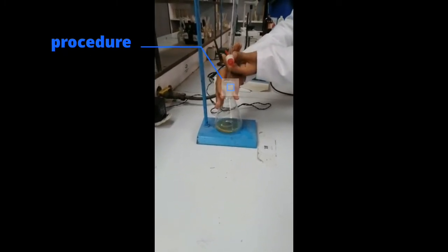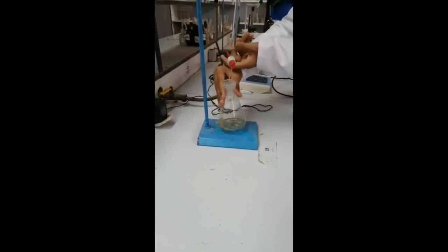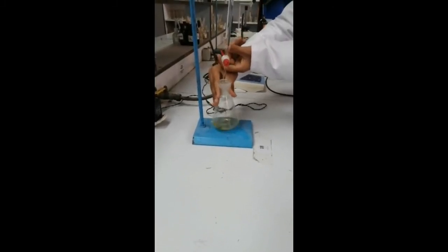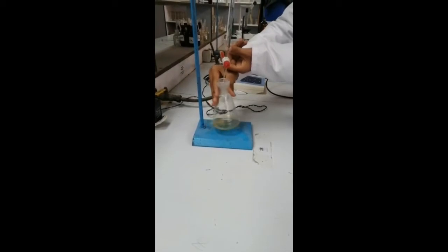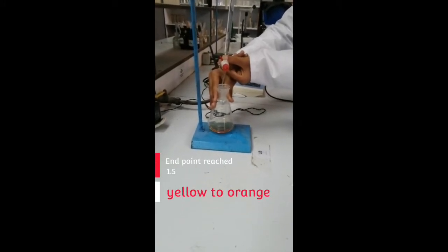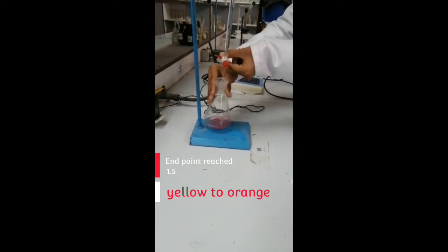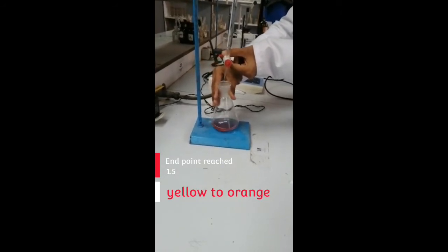First of all, the principle of borax mixture. If a pure sample of borax dissolves into water, it readily hydrolyzes into two things: sodium hydroxide and boric acid. As we all know, boric acid is a very weak acid, so the produced NaOH can be directly titrated with standard HCl using methyl orange.